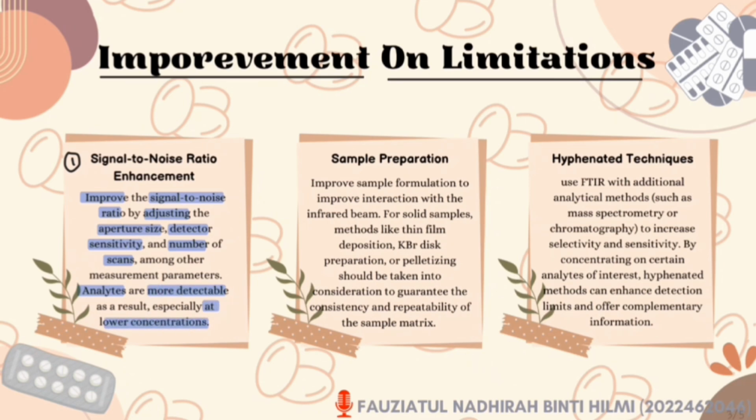Moreover, we need to improve the sample preparation, which means we can improve the interaction with the infrared beam by improving the sample formulation. For example, for a solid sample, methods like thin film deposition, KBr disc preparation or pelletizing should be taken into consideration to guarantee the consistency and repeatability, and the sensitivity of the sample matrix.